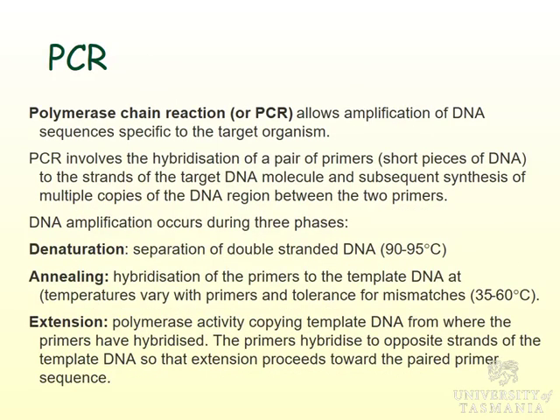By far more important for diagnosis and detection is a test called polymerase chain reaction, or PCR. Who's heard of PCR? Who's not heard of PCR? Right, okay. So PCR is a really interesting technology. It's bringing molecular biology to non-molecular biologists. Pretty well anyone can do it. It's kind of a piece of cake.